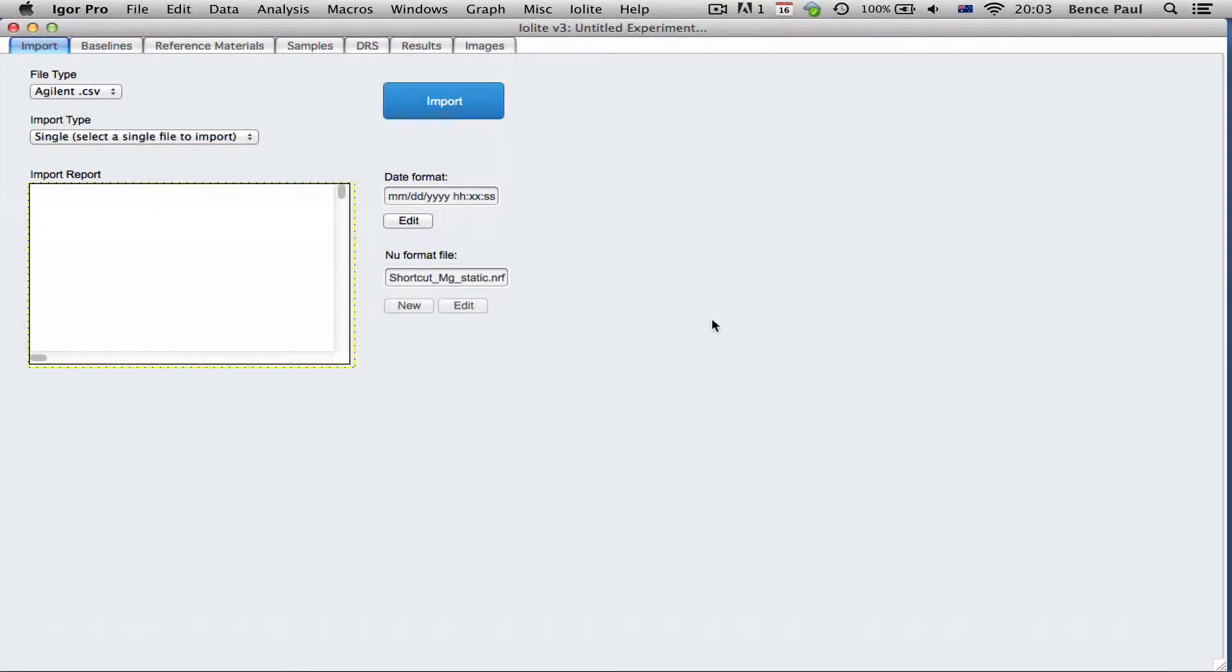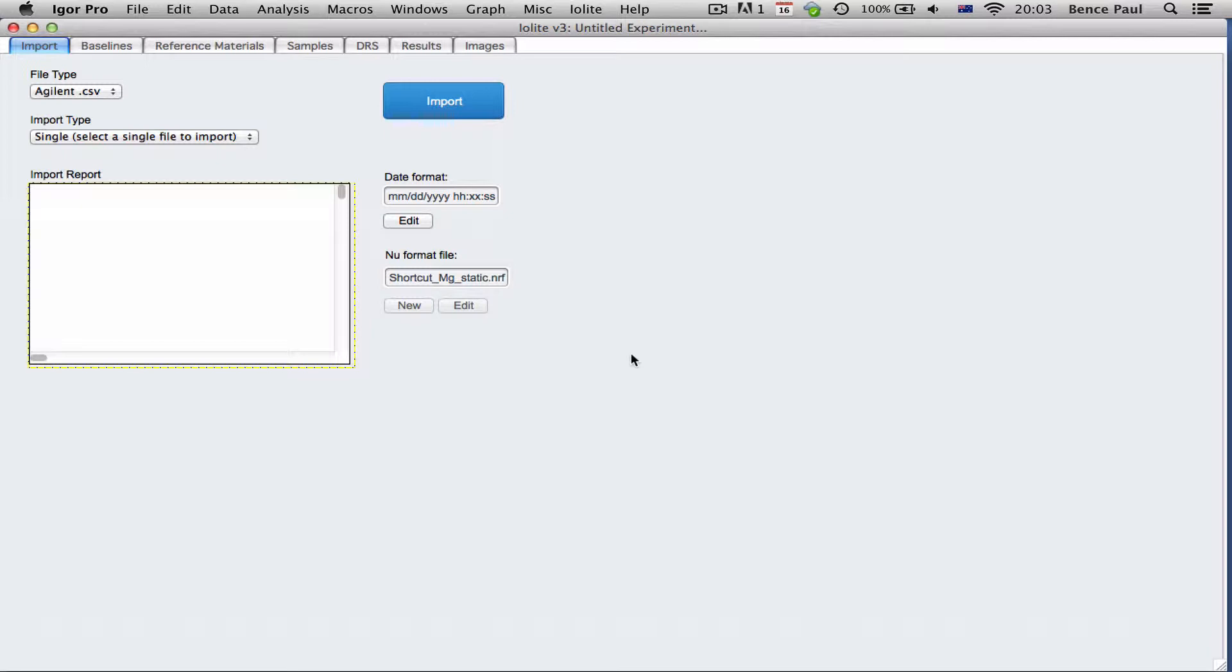I just wanted to demonstrate the new mass spec syncing feature that's going to be part of iLight 3. To demonstrate this I've got two data sets.